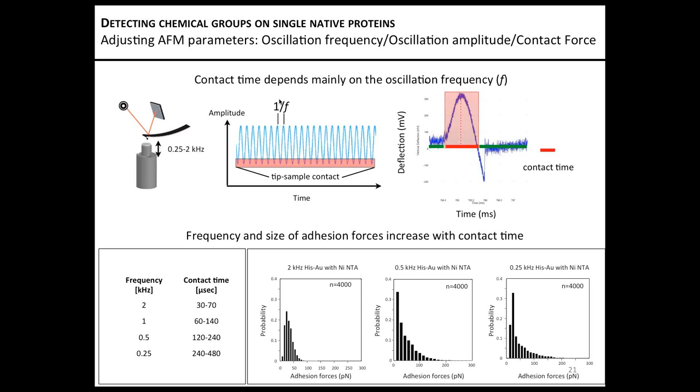For cellular levels, it can be a problem because cells are not flat at all, and if the tip comes between different cells, the drag force can be very different. Finally, the force curves are very different on the top of the cells and between two cells, and the drag force plays a quite huge role between cells. In this case, some hysteresis can be taken as adhesion, in fact, by the software.